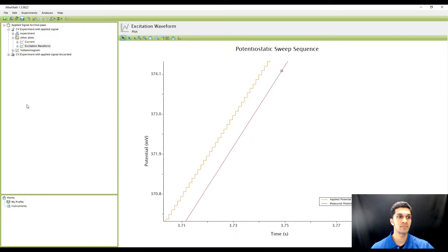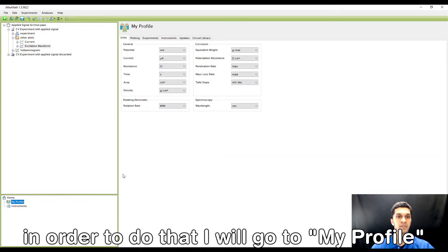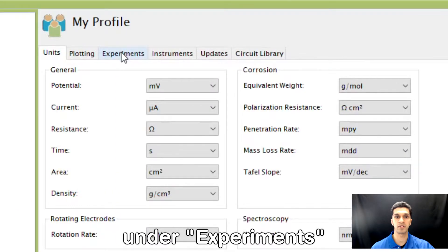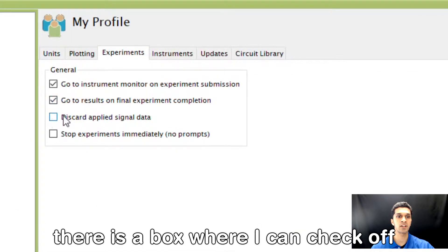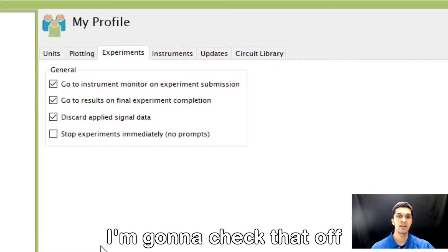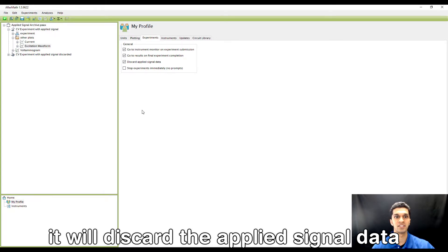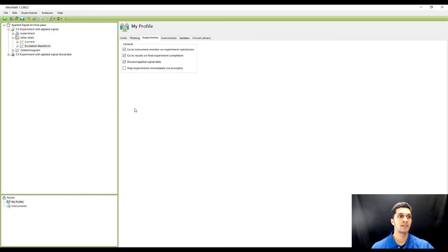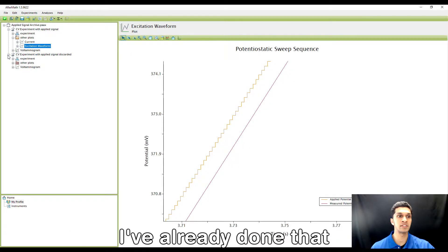Now if I want to change that, I will go to my profile. Under experiments there is a checkbox that says discard applied signal data. Check that off, and then the next time I perform an experiment it will discard the applied signal data.